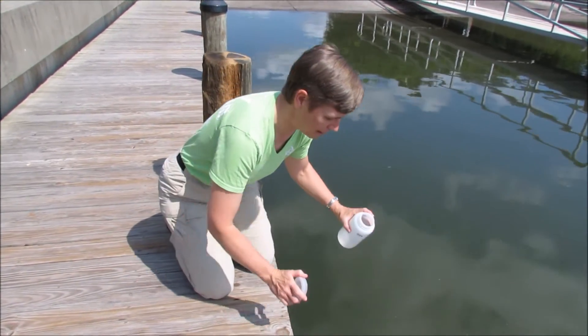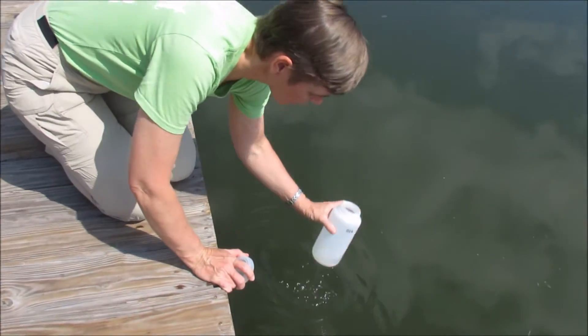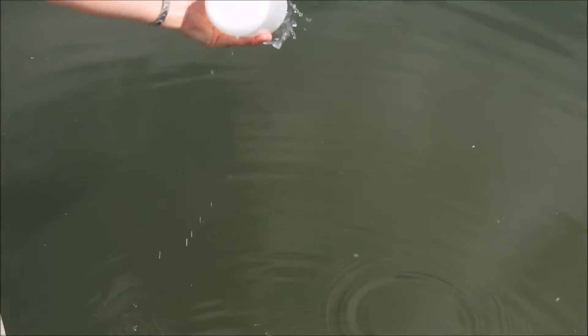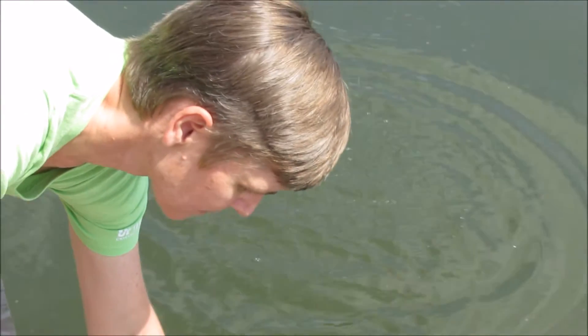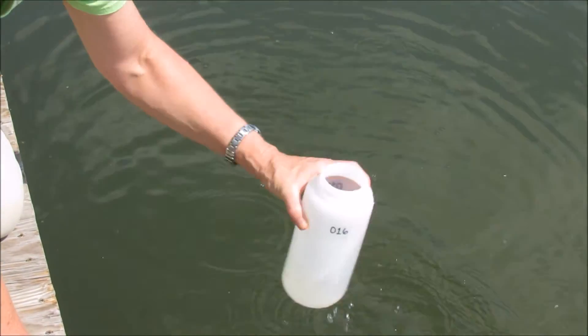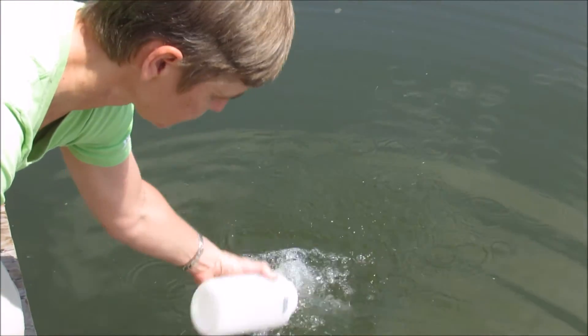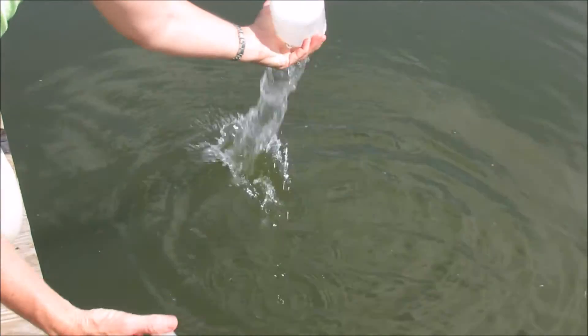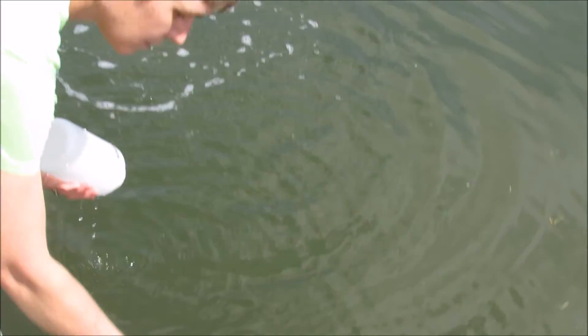To rinse it three times, we're going to fill it about a quarter to a third of the way full, swirl the water around, and dump it out. We're going to do that a total of three times. We're also going to rinse the lid three times.